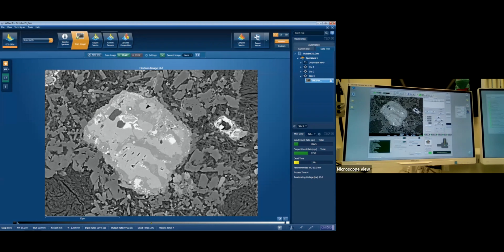So this is a mine sediment, so there's probably some sort of hydrothermal fluids that came through at some point. And what that's done is basically that fluid could interact with the mineral. It can take certain elements away from it and leave others behind, which looks kind of what's happening here. We've got these patches of different grays, and it's all a little bit messy. If it was a nice clean crystal, I would be alarmed.